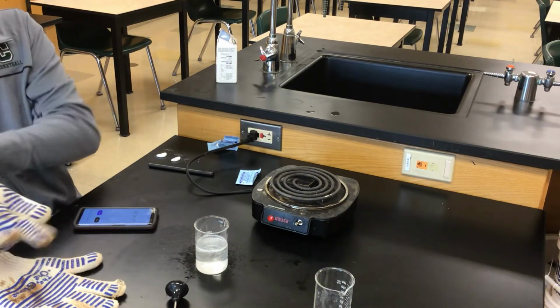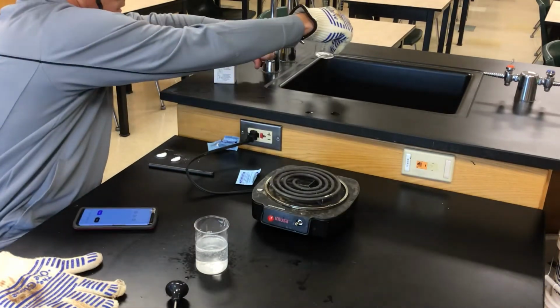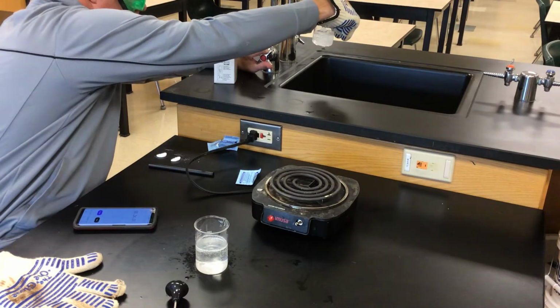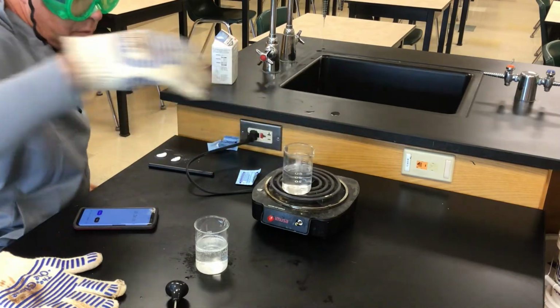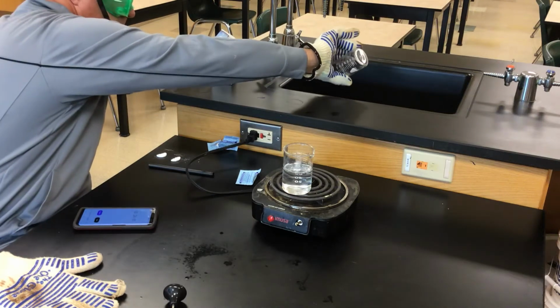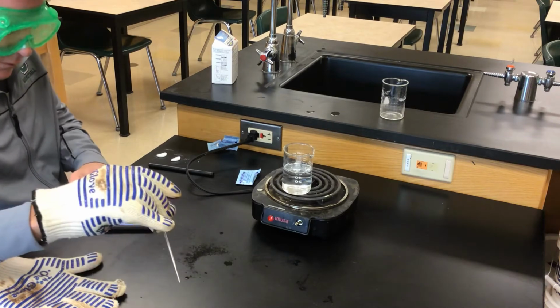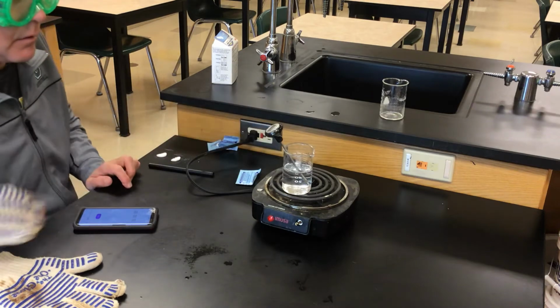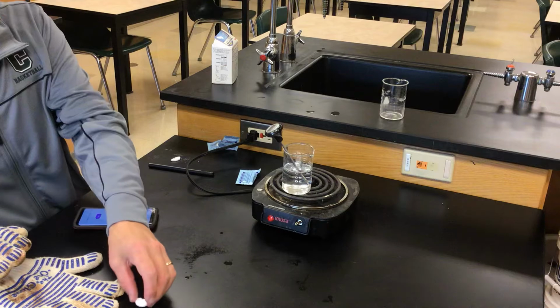And with any relatively good experiment, which I expect this to be, we should do it a third time, just to make sure we have a pretty good set of data points. So again, I'll fill it with 100 milliliters of water, put it on the heat, dump this one, reset my clock. We're only at 28 right now. But like I said, it won't take very long.